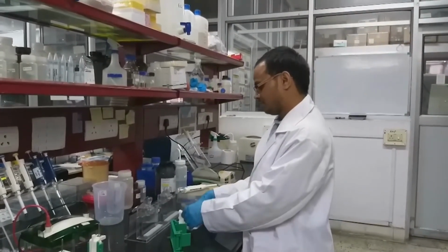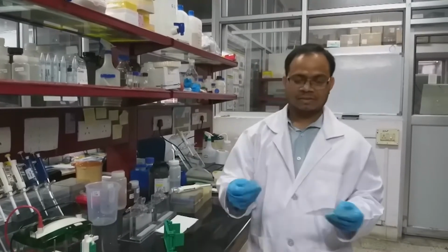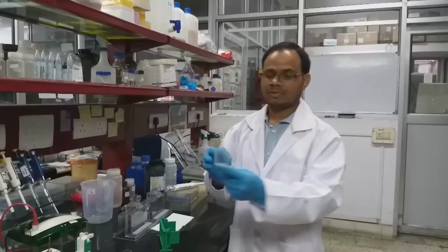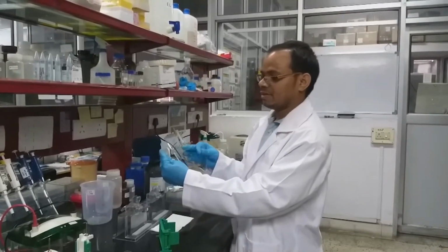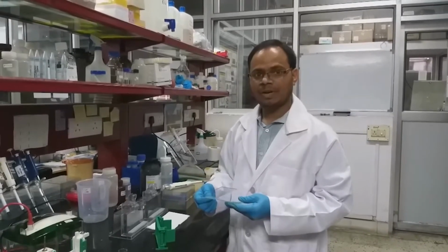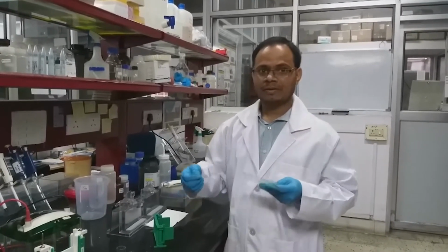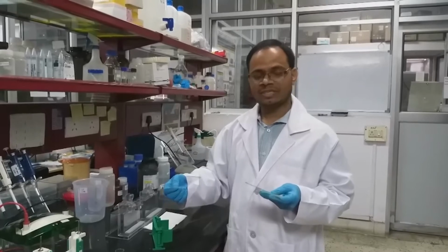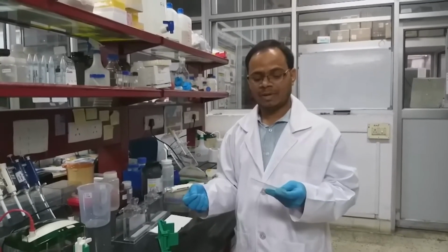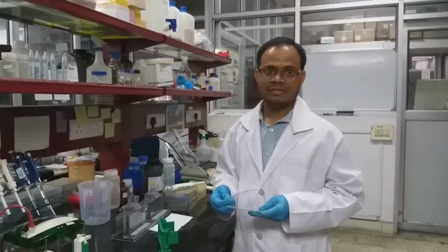So these are the glass plates. This is a very thin one. This is the main glass plate, a 1.5 mm glass plate. It is available in 1 mm glass plates also. If your loading volume is small, like 20 or 30 microliters, then a 1 mm gel is good enough.